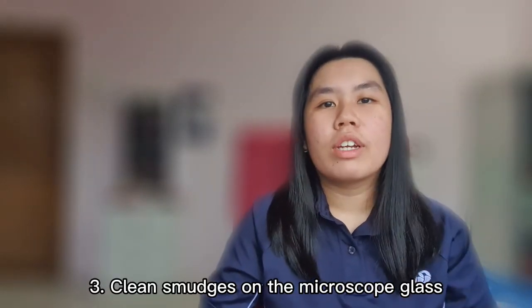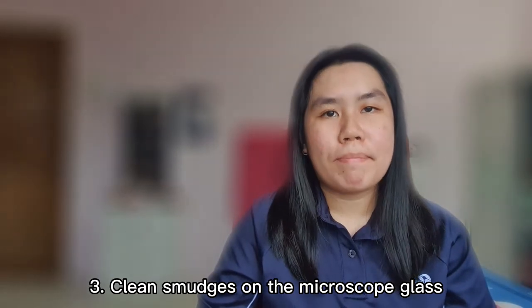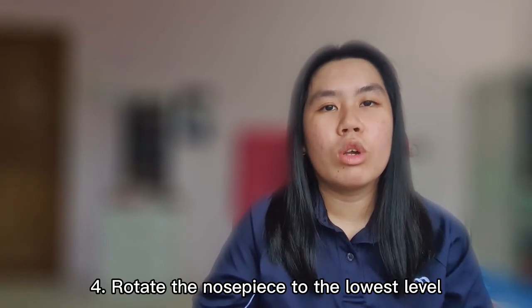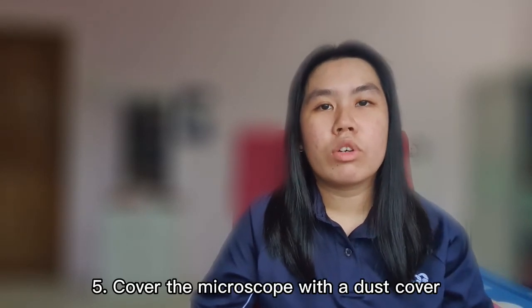Third, we should clean the smudges on the microscope glass with a piece of lens paper. Avoid using other materials such as cotton. This is because they will scratch the microscope glass too. Fourth, rotate the nosepiece to the lowest level after finish using the microscope. If we leave the nosepiece up while storing it, the gear on the device will wear out. Lastly, you should cover the microscope with a dust cover to protect it from dust and debris.